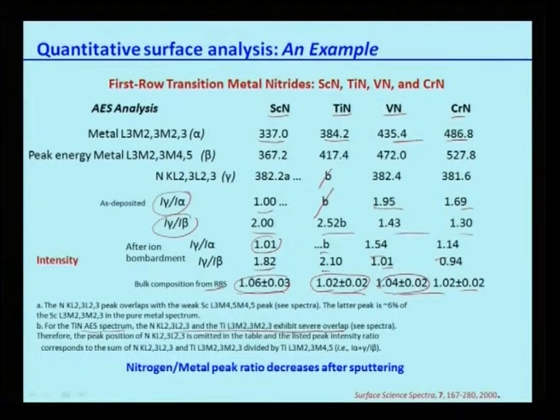This is close to vanadium nitride. This is a little bit lower than the actual value. So that means AES is not that great an analysis as far as SIMS or XPS is concerned.